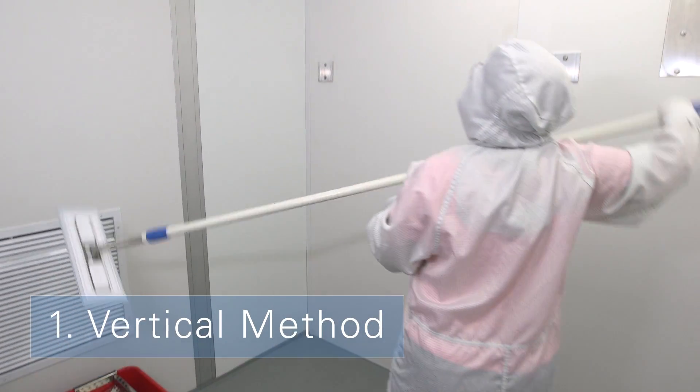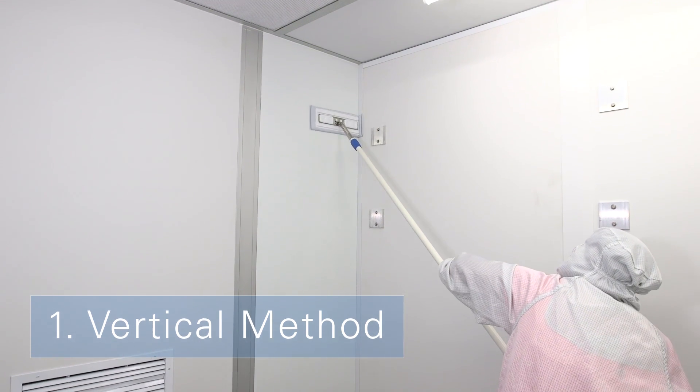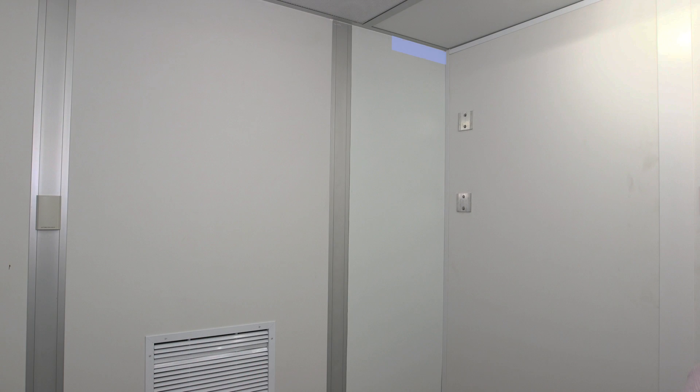For the vertical method, start at the corner of the room furthest from the entryway, moving the damp mop from the topmost corner down the wall to the floor using overlapping, unidirectional vertical strokes, wetting the mop about every two square meters. Replace the mop head if it touches the floor.